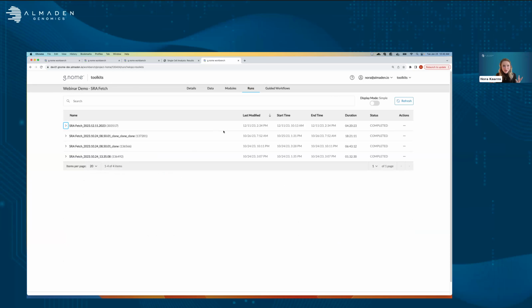Okay, so that is a wrap on the Genome demo and talking about single cell data. At this point, I'd really like to open the floor to any questions that I can answer.